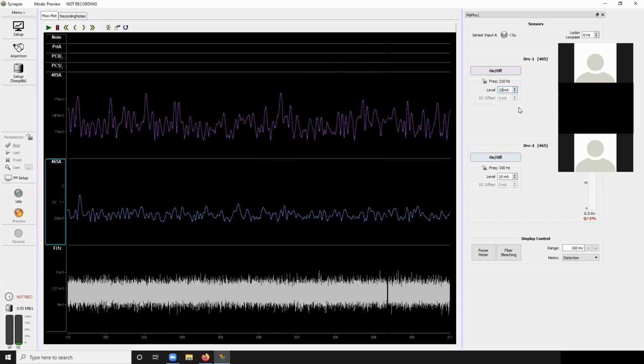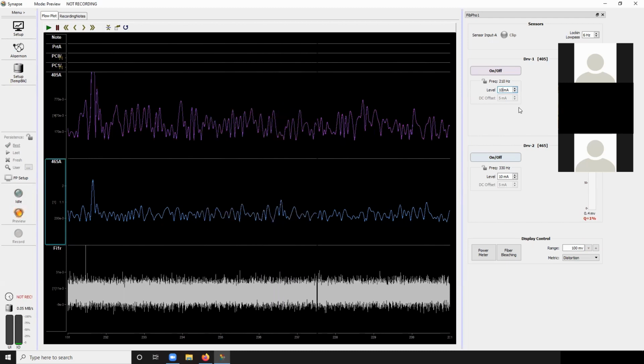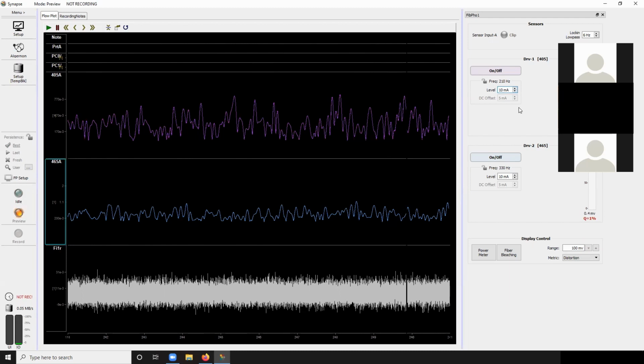The issue with the PM1 is there's not a good way to stick that MF connector on your actual subject cable into the PM1 and get a good estimate, because it depends on the depth and stuff like that. Now, I know your group has external power meters, so you can use those as well. We're working on adapters for the MF cable.